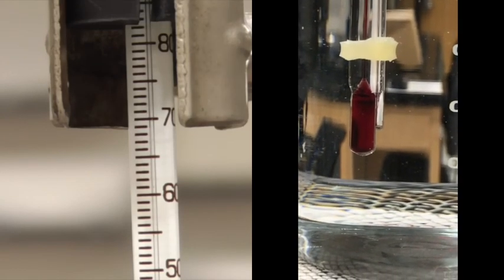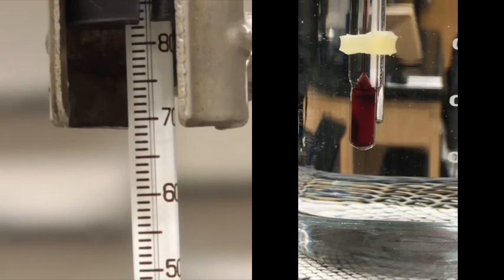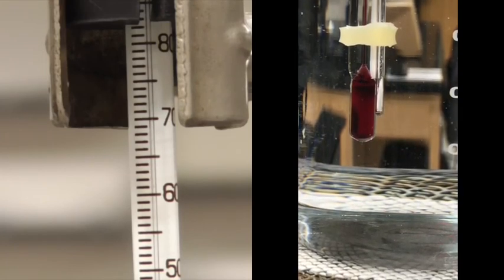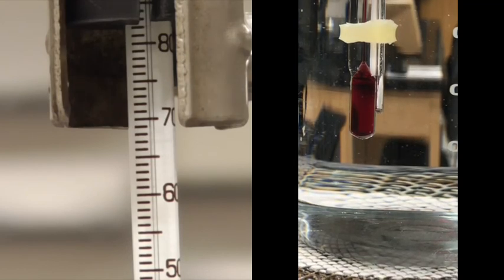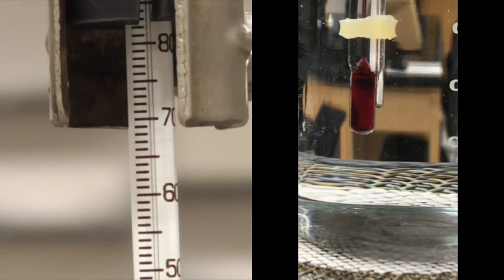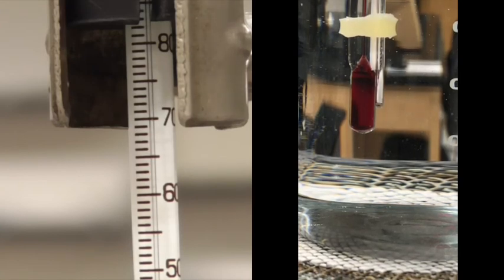Alright, here's our unknown number 3, the second trial. And this trial we're going to try to be a little bit more accurate, so we're going to try to get a narrower range of our melting point. So we're going to heat it up to about 60 and then we'll slow down.